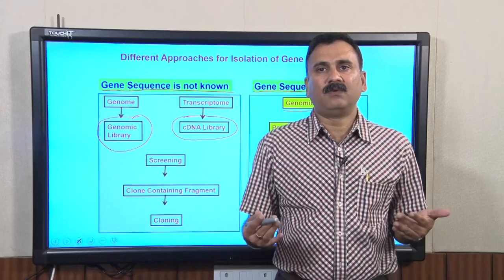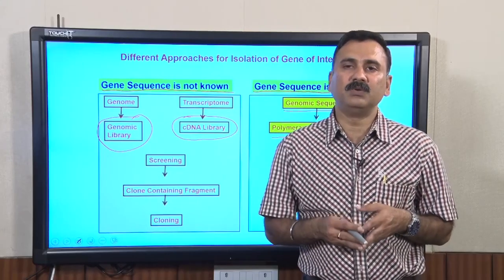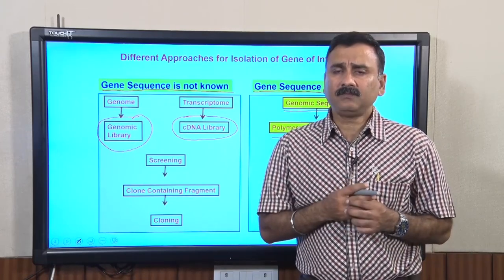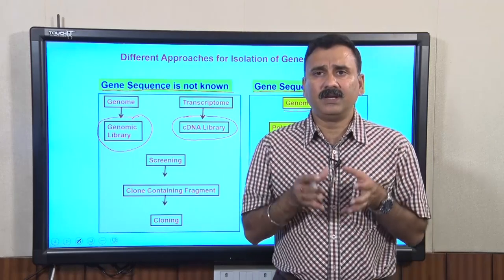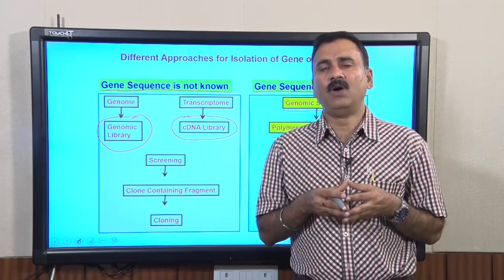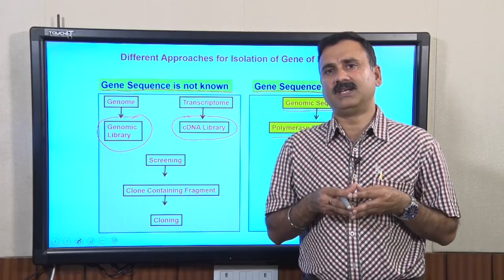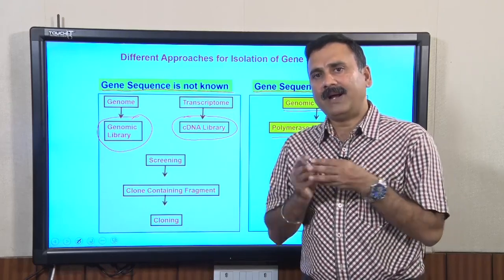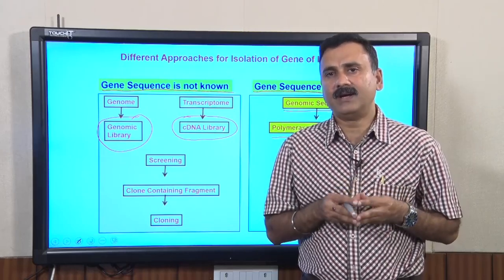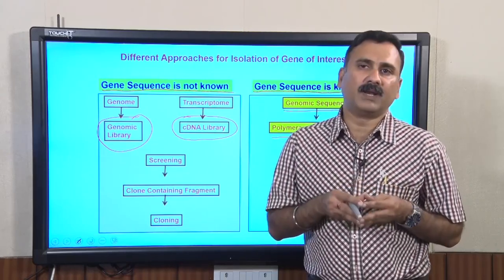So in today's chapter, we are going to discuss the polymerase chain reaction. And before getting into the intricate mechanism as well as the technical details of how to perform the polymerase chain reaction, let's go back and see how and why DNA synthesis is required in the eukaryotic or the prokaryotic cell.